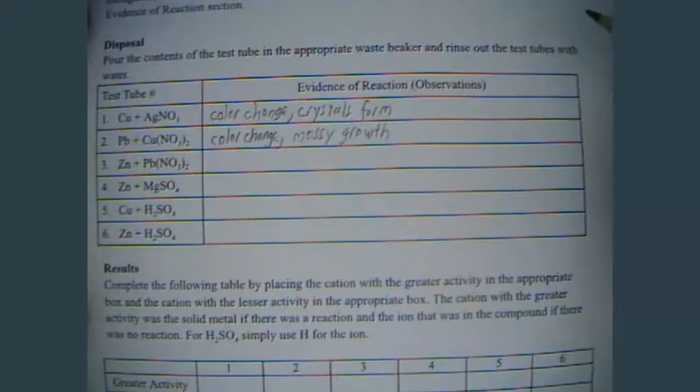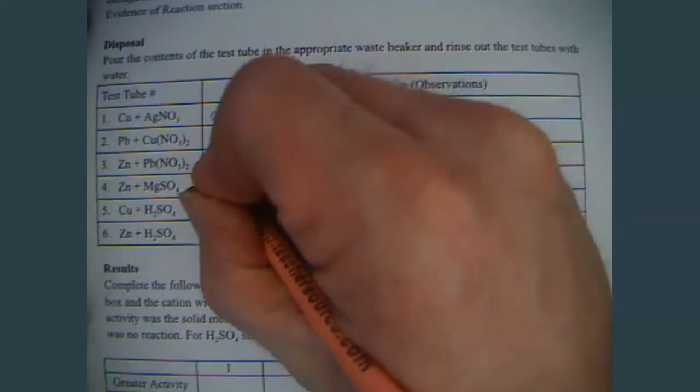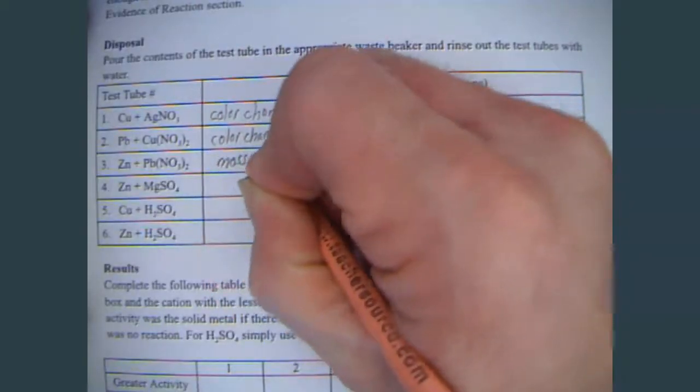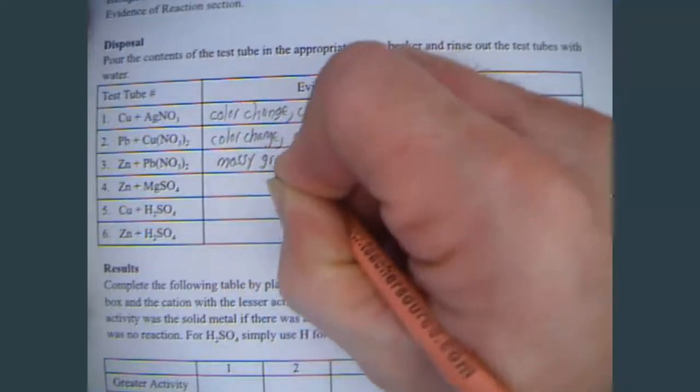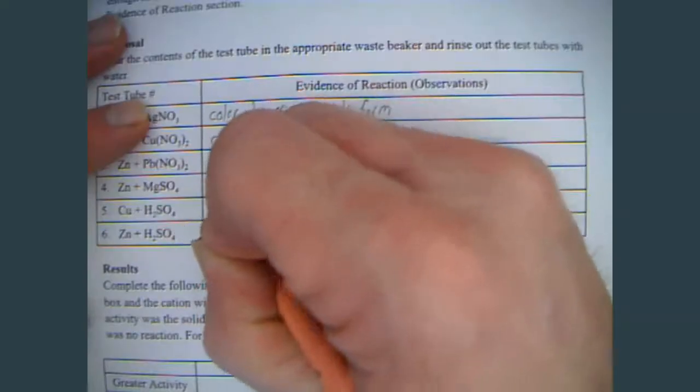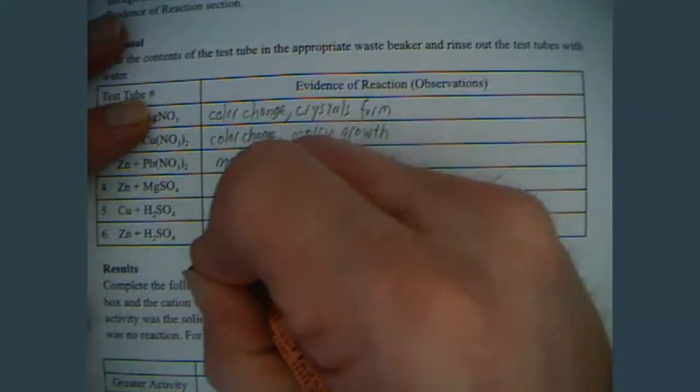For the third one, we had the zinc and the lead nitrate. And again, in this case, it looked like we had a change. So, we had a mossy growth again. Not too much of a color change in that one, though. They're both colorless. This one, we had no reaction. This one, we had no reaction. And then, the zinc and the sulfuric acid, we had bubbles.